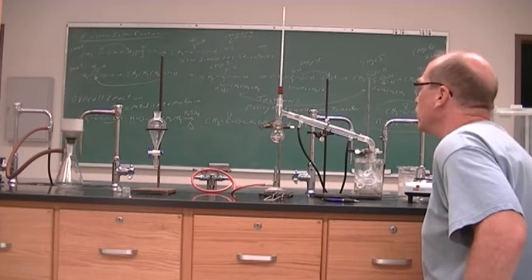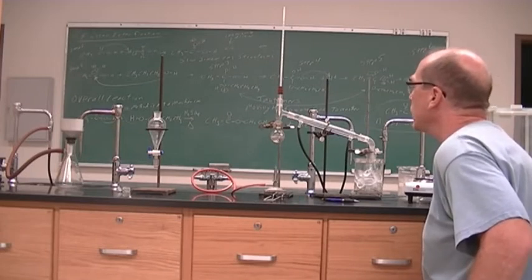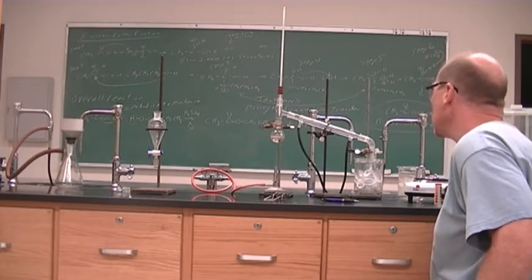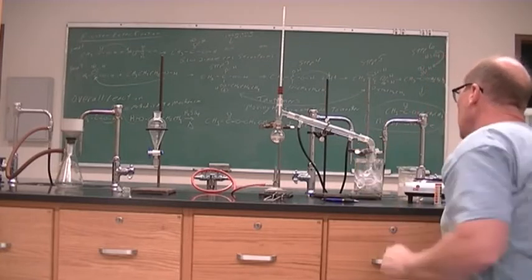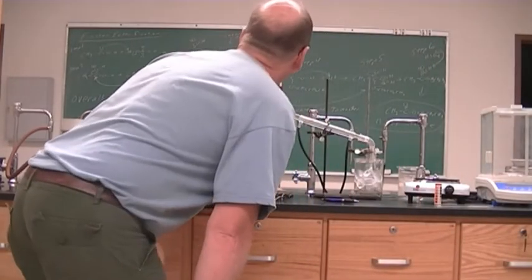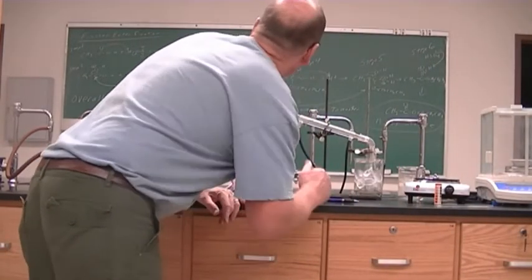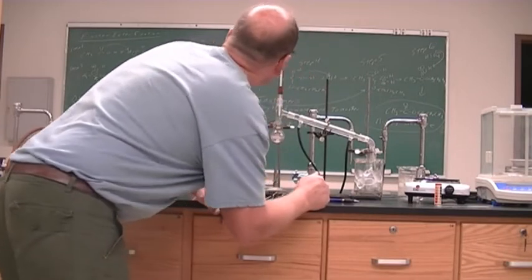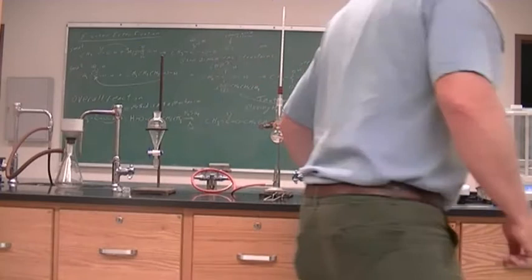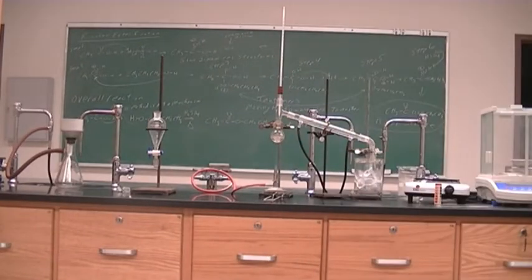All right, so we are getting some solvent front going up and condensing. It's in the condenser. And first drip is there, first drip. And your temperature is at 40, 60, 80, 92 degrees Celsius. So the first drops are at 92 degrees Celsius.